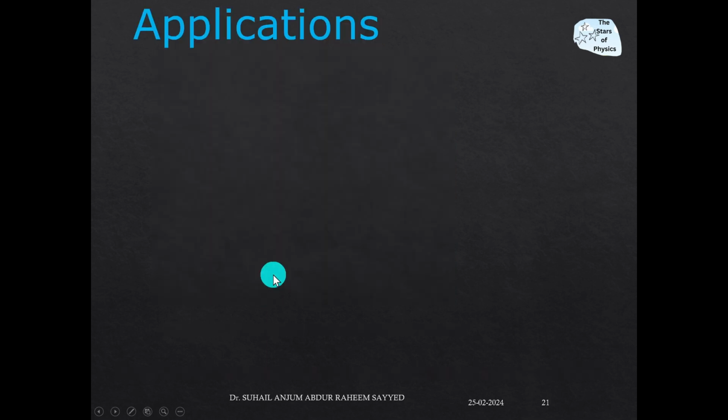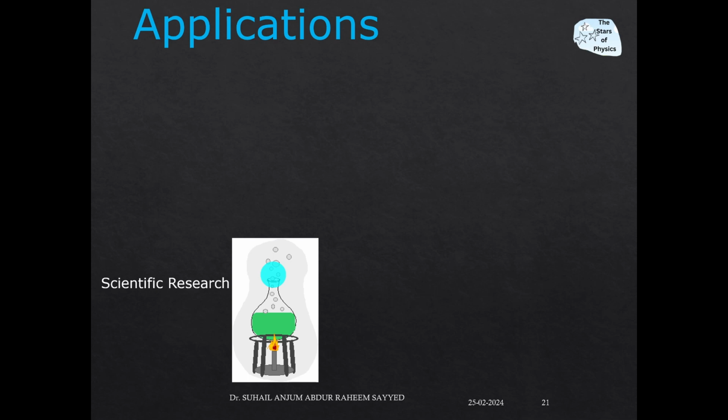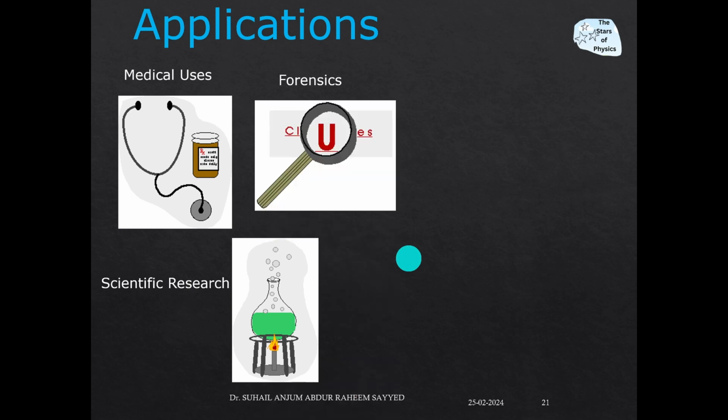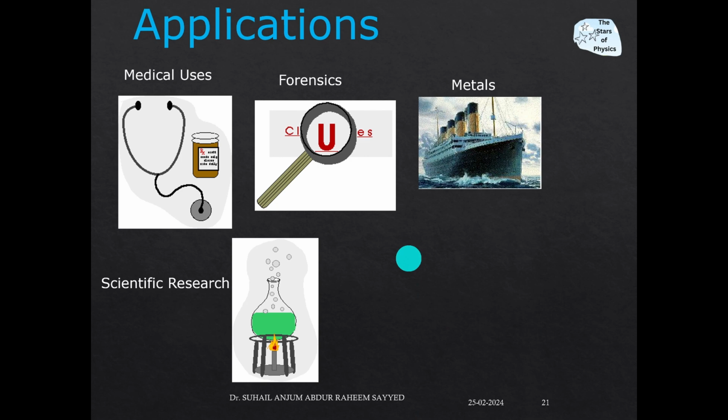Now what are the applications? There are various applications in the scientific field, then in medical uses, then in forensics, and then to study metal surfaces, etc. So these are the various applications.